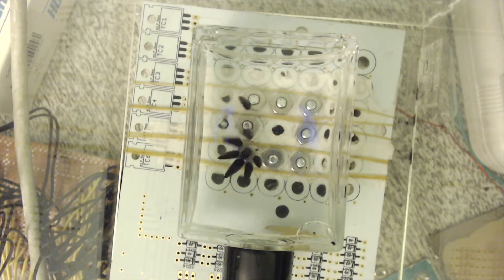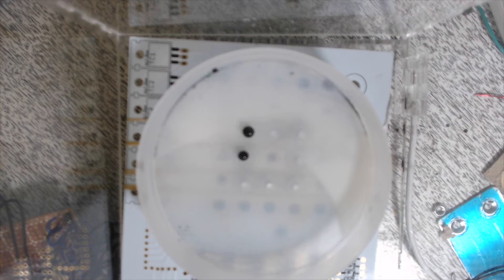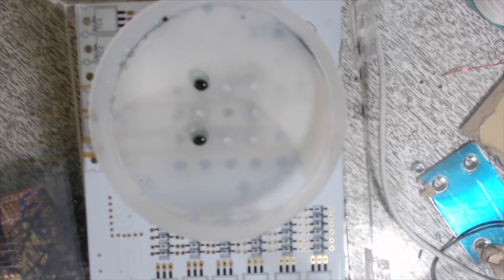In today's video, I would like to show a new way to drive your ferrofluid — such as to reduce your current requirements, move heavily diluted droplets, and move with incredible pulling strength.